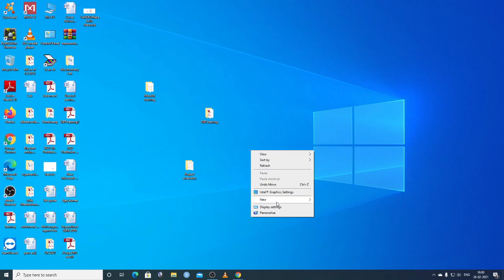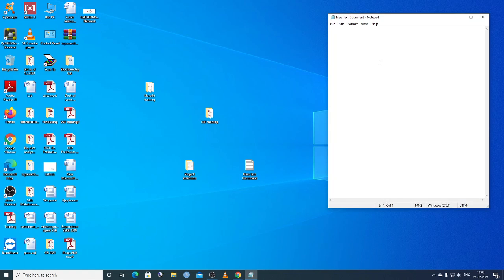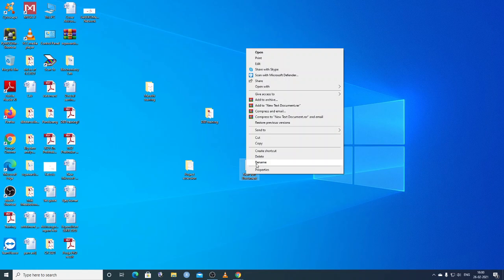or for example, somebody has sent you this sequence in a text file. So this is a text file of the sequence. It doesn't have any name. For example, instead of Saccharomyces cerevisiae, let us call it unknown. So this is an unknown sequence, and let us give this file the name unknown also.